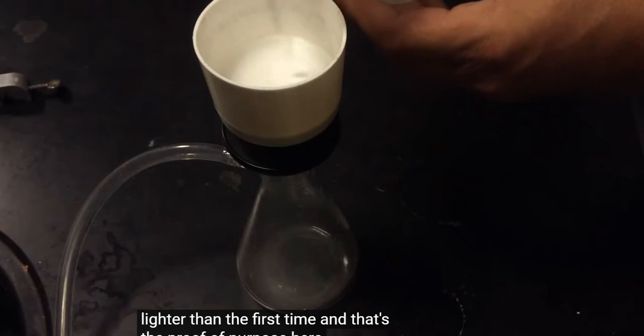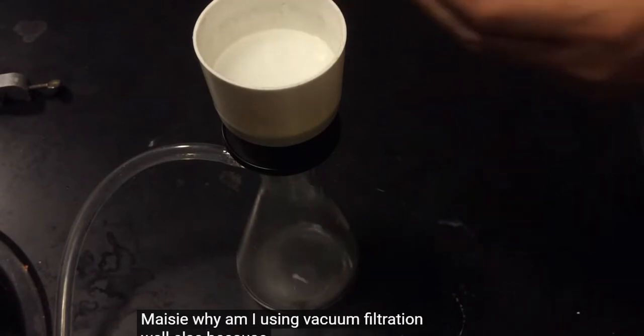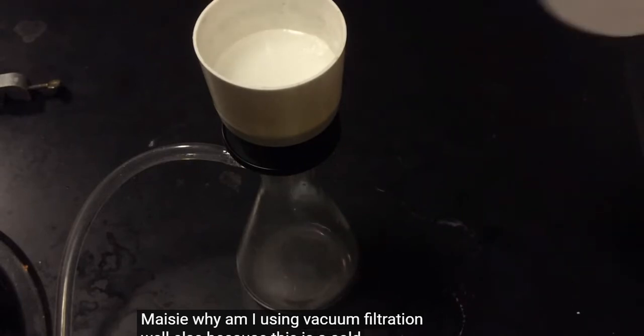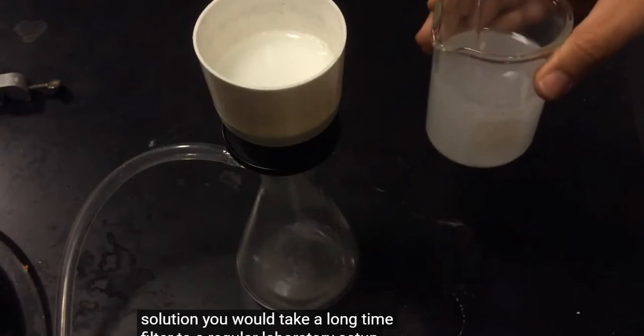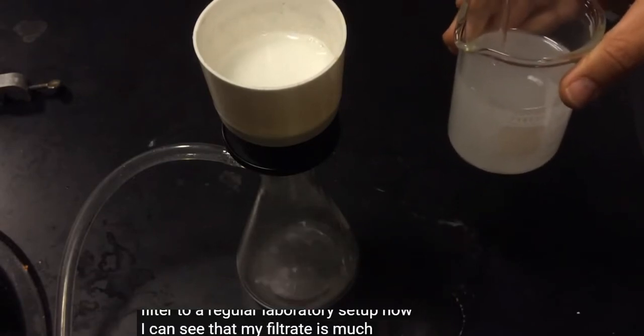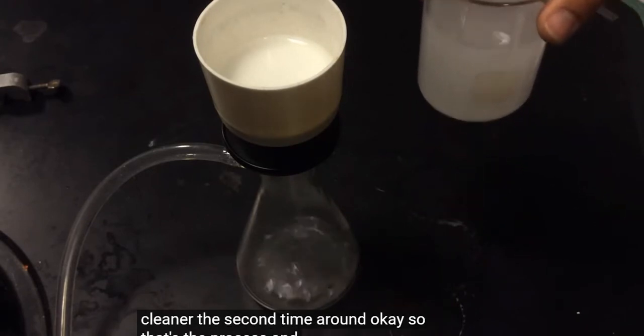You may say, why am I using vacuum filtration? Well, it's because this is a cold solution. It would take a long time to filter in your regular laboratory setup. I can see that my filtrate is much cleaner the second time around. Okay, so that's the process. Keep going, keep cleaning this out.